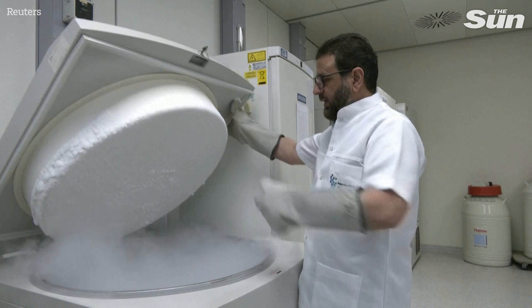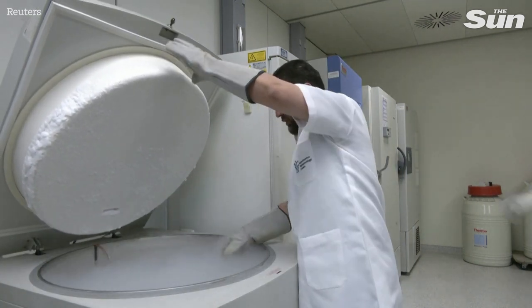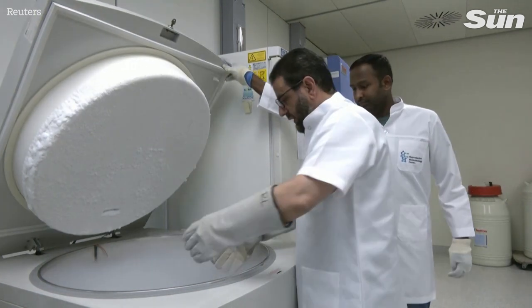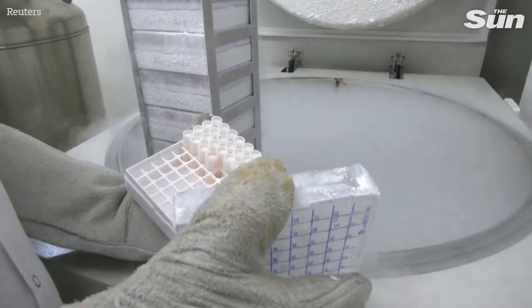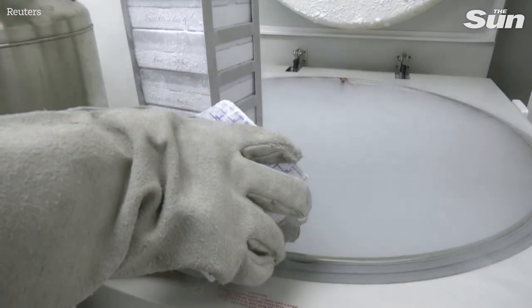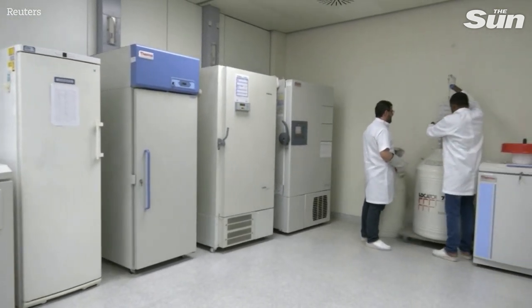Liquid nitrogen tank. So we have the cells stored in the boxes. We have cells stored in these boxes.